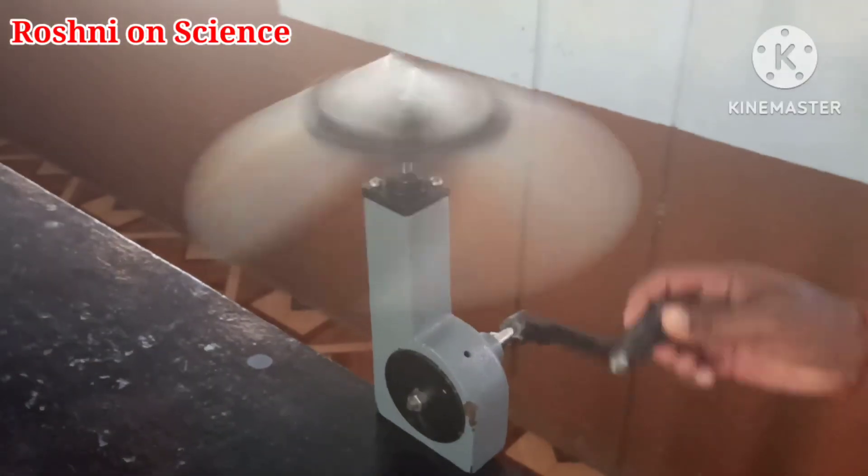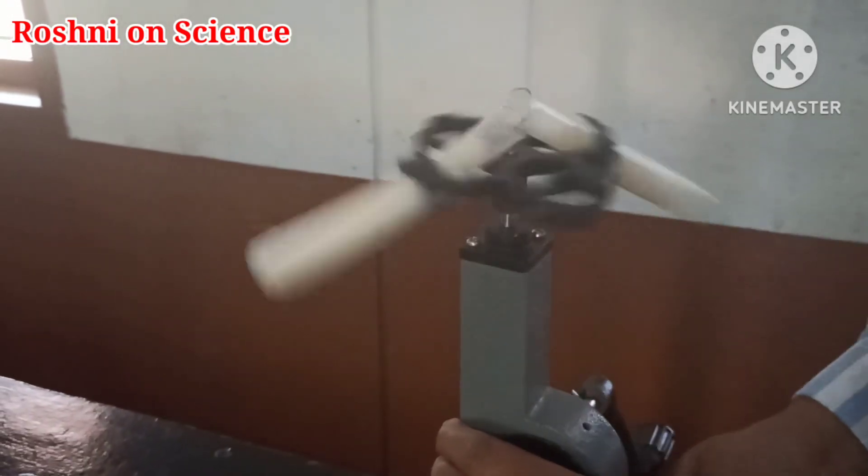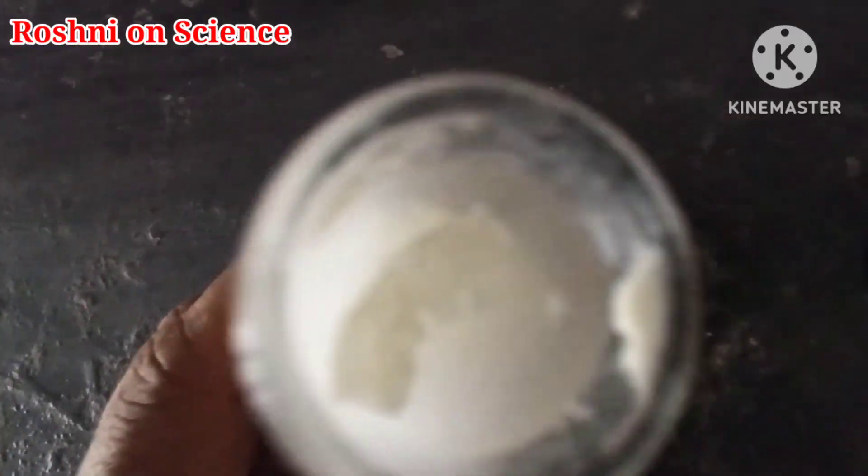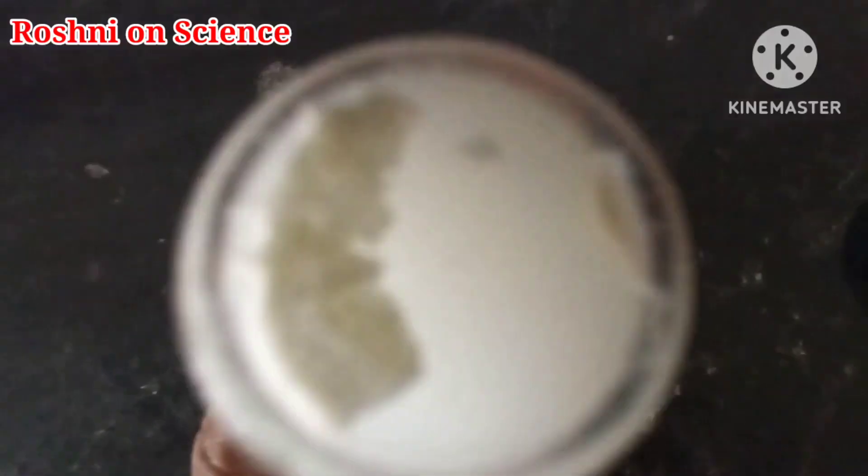The principle involved in this process is that the denser particles are forced to the bottom and the lighter particles stay at the top when spun rapidly. As a result, butter gets separated from curd.